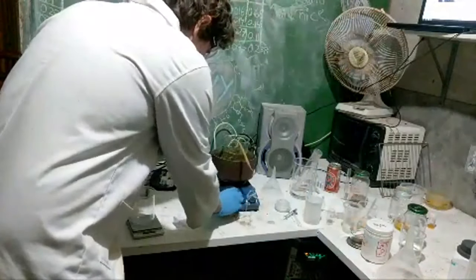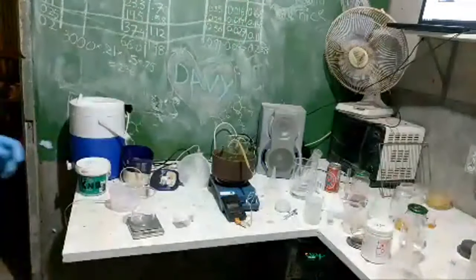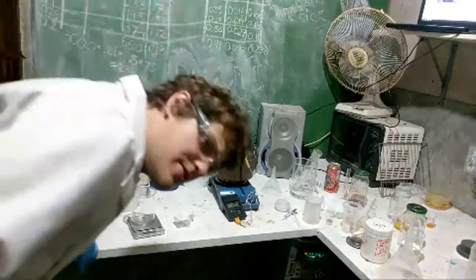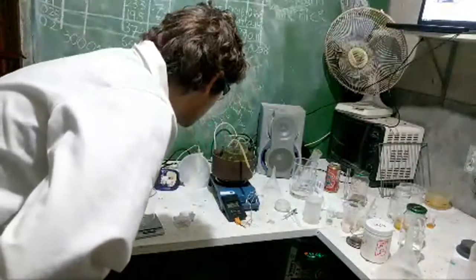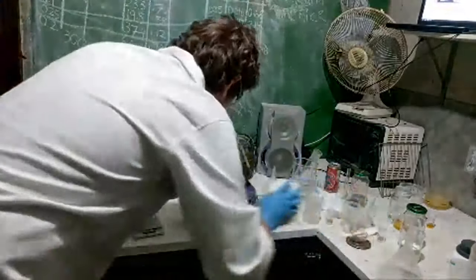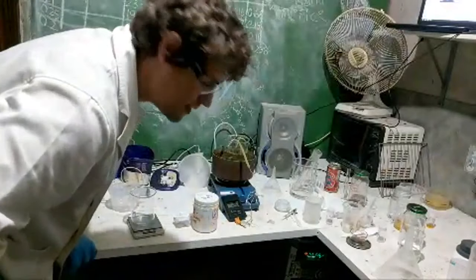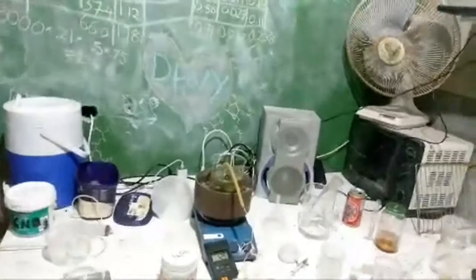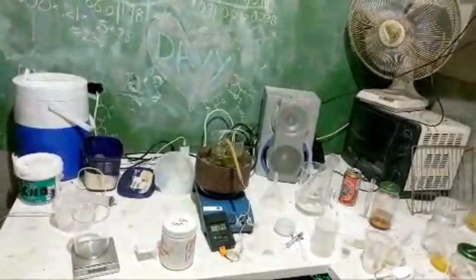Okay, chemistry-wise, that's getting colder. So, we've got 800 mils of bleach. How much hydroxide should we use? Not hydroxide. How much iron oxide are we going to be using? That's a key question.